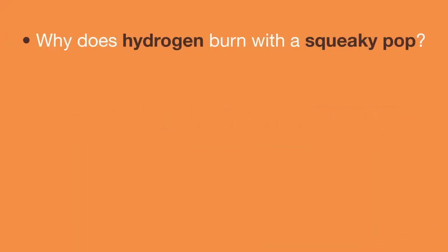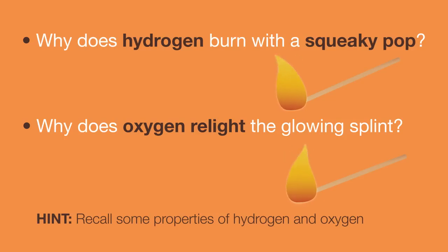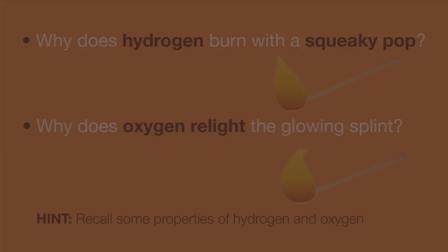Why does hydrogen burn with a squeaky pop? Why does oxygen relight the glowing splint? Hint, recall some properties of hydrogen and oxygen. Please pause the lesson to think about this and resume once you are done.